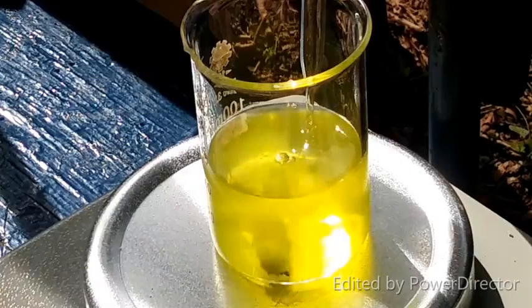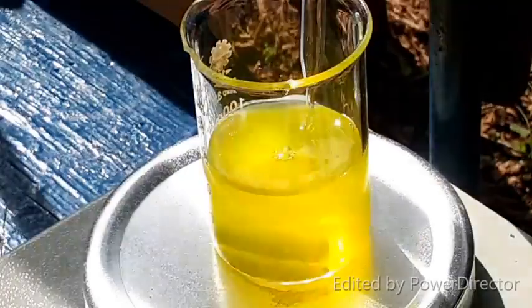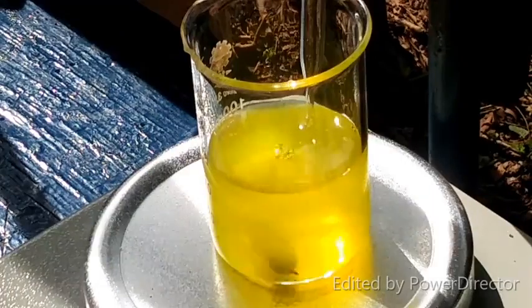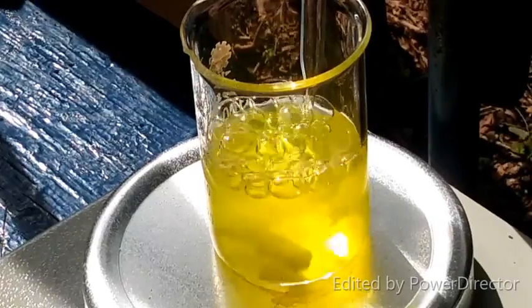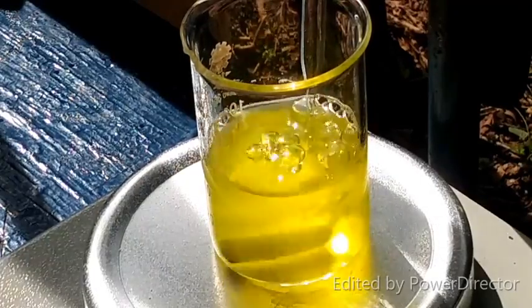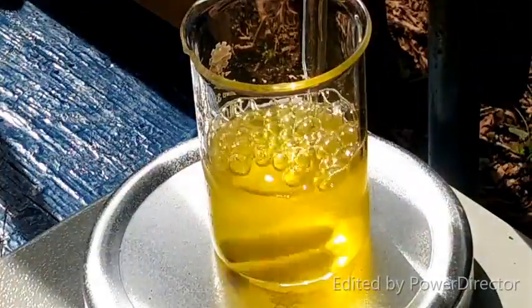Now we don't necessarily want anything to precipitate, or we just want it to be on the edge of precipitation. Something kind of like this. Okay, maybe just a touch more. Alright. Here we go. Now remember, it will take a little bit to purge the air through the system. Okay, it's just starting to come over now.